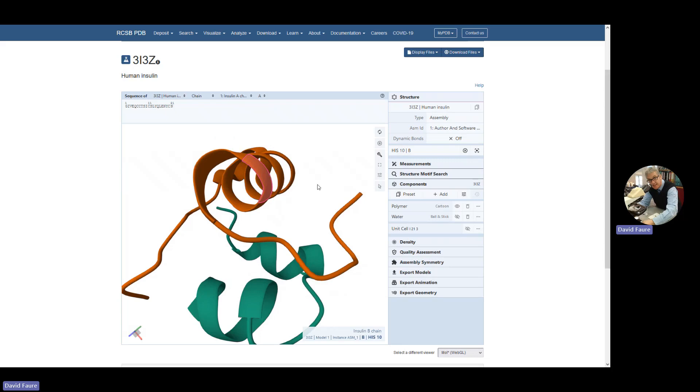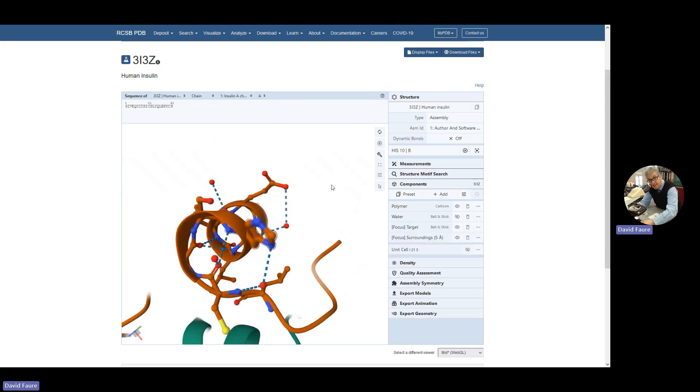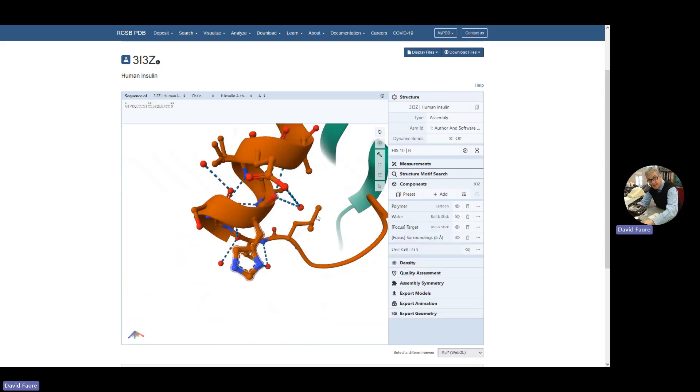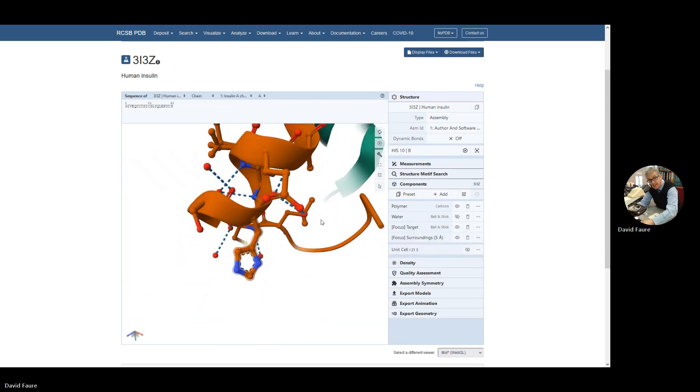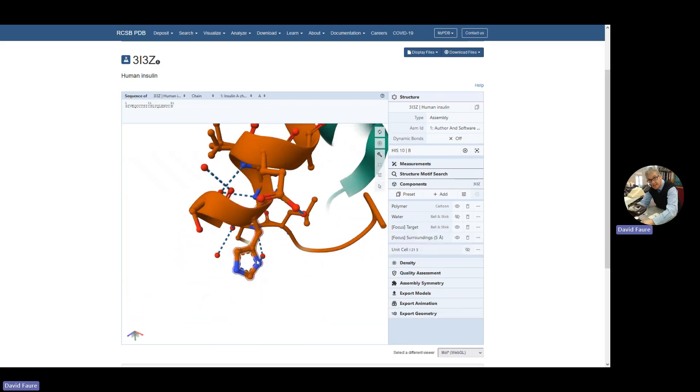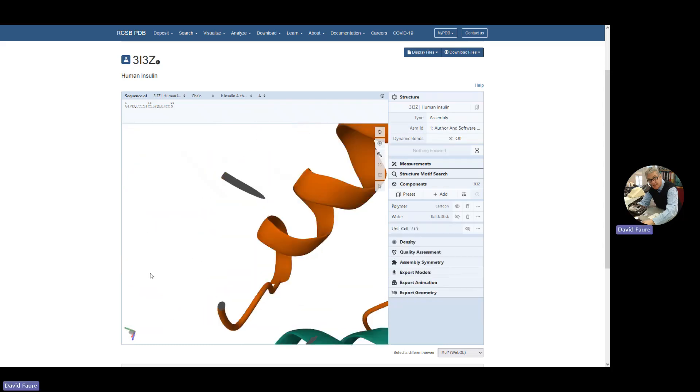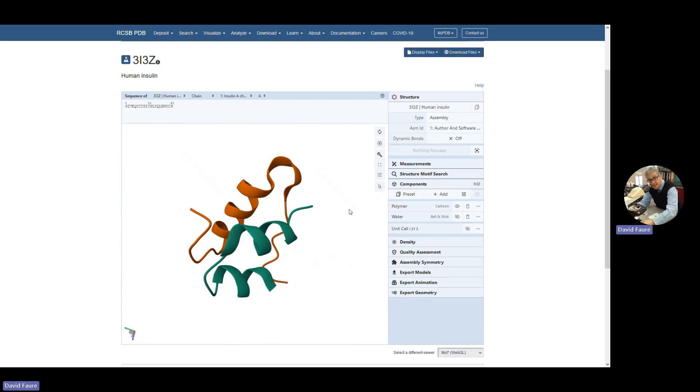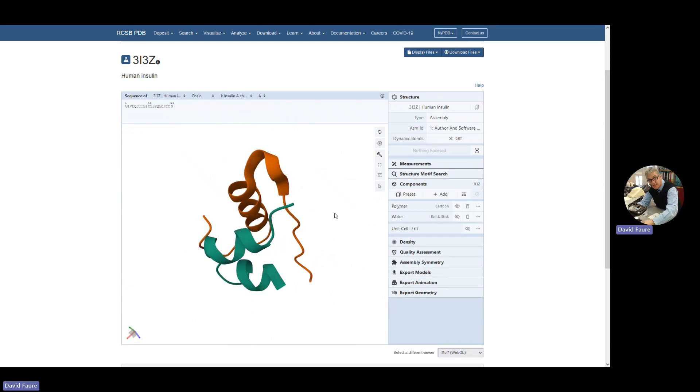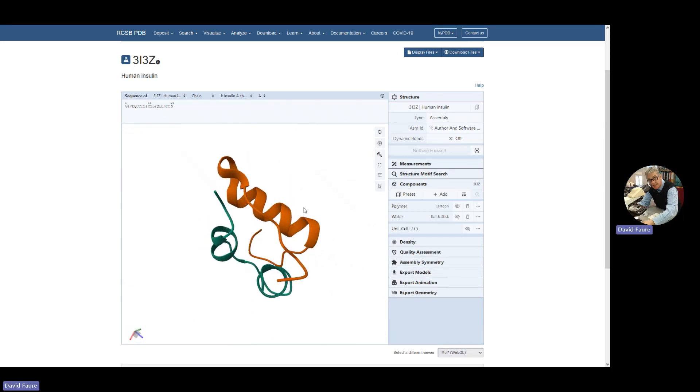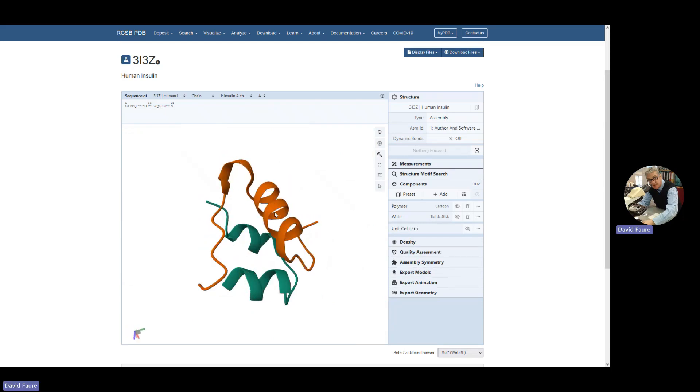If we click on a part, we can have a look at the side chains. You can see this is a side chain with these hydrogen bonds. Let's click back on the background to go back.